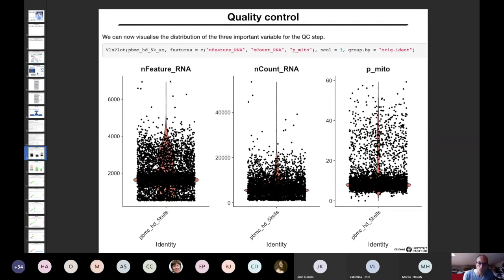And you can choose something else than the violin plot. You can use a histogram, for instance. But here is what it looks like on a violin plot. So you see, well, no, actually, you don't really see clearly because everything is a little bit overlaid. But it's very easy to extract this metadata table and do your own graph. And usually that's what I do.